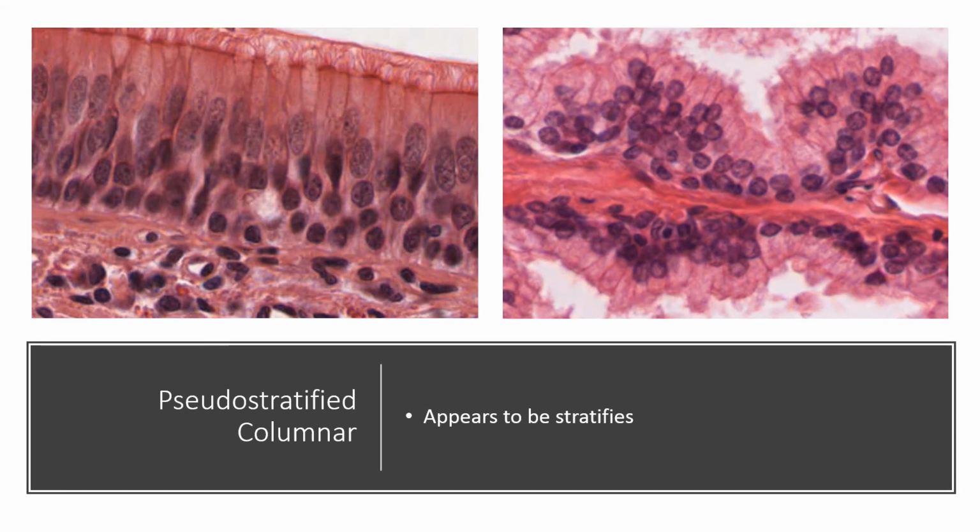Now this is that pseudostratified columnar epithelium that I talked about. Here you can see these are very clearly rectangular shaped cells, but look at the nuclei. It really looks like they were mixed up in a cup and then thrown onto the image, right? They're just a jumble. We couldn't really draw a line from one nucleus to another and form straight lines, right?